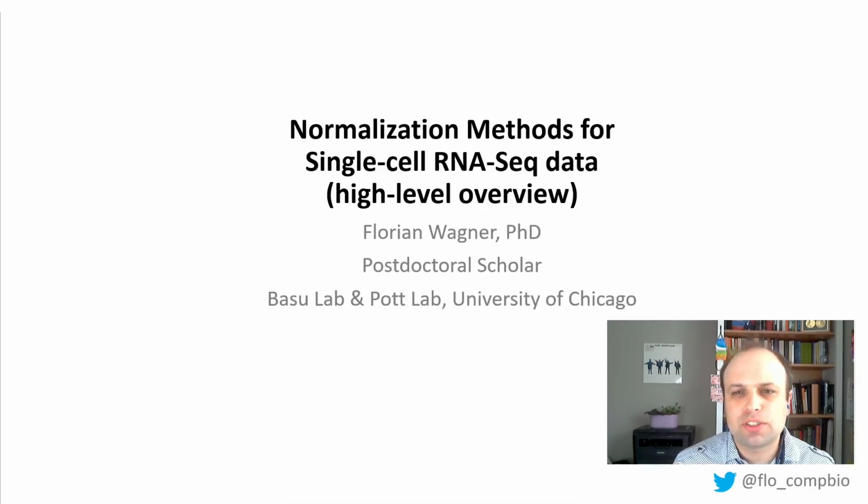Hi, my name is Florian Wagner, and in this video I'm going to try to give a high-level overview of different normalization methods for single-cell RNA-Seq data. So I'll try to explain these methods in an intuitive way, and I'll try to simplify some of these methodological details so that they're a little bit easier to understand.